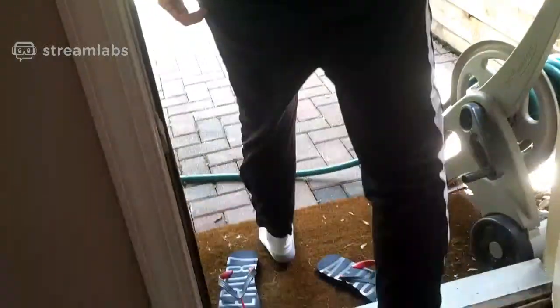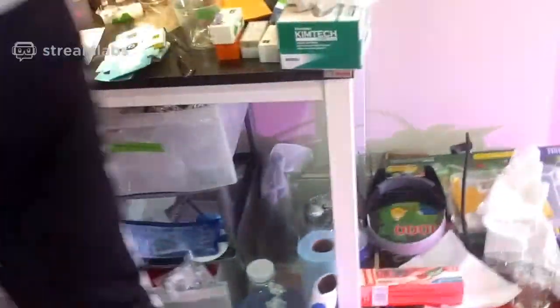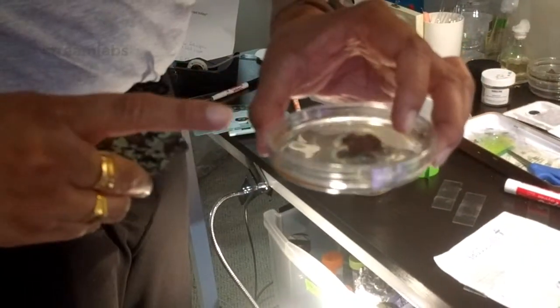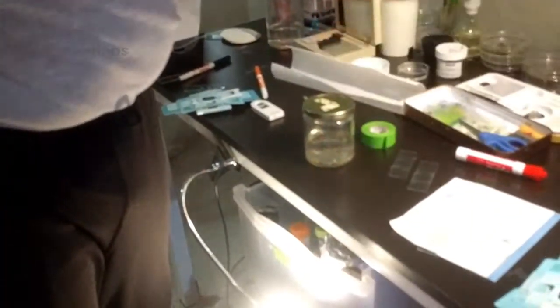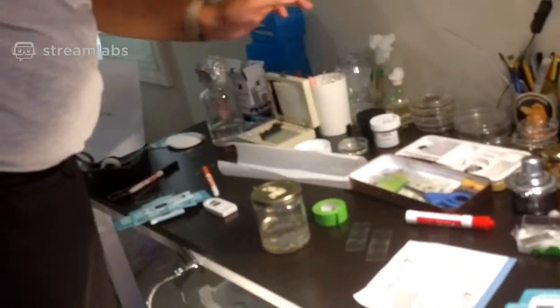Yet other times, let me see. Just be right there. Okay? So I have this piece of lichen. See this? This piece of lichen. I just take this lichen and put it in water. Here, I have a plate. This plate has been used 100 times. It's still okay. It's a plastic plate. There's some lichen. I put it in water. And the forms of life that you can see is endless entertainment for days, months sometimes. All right. So this is a very easy way to grow things.